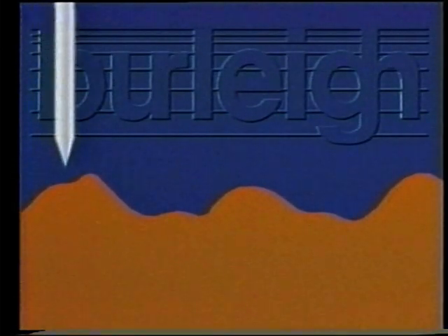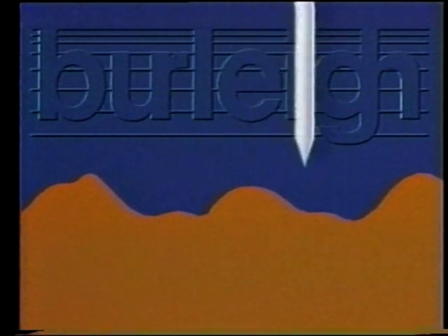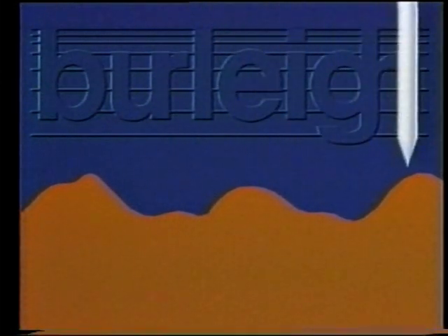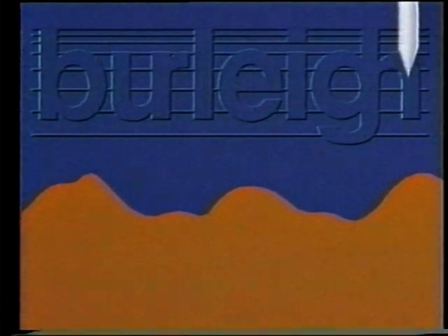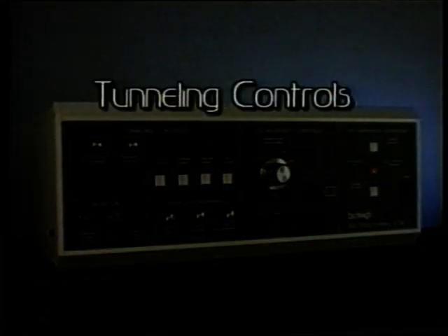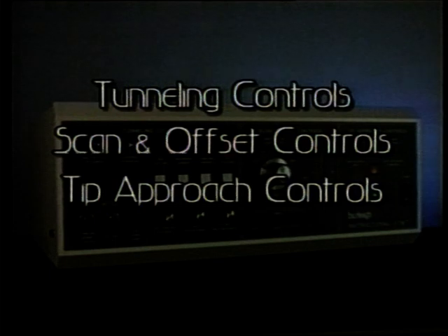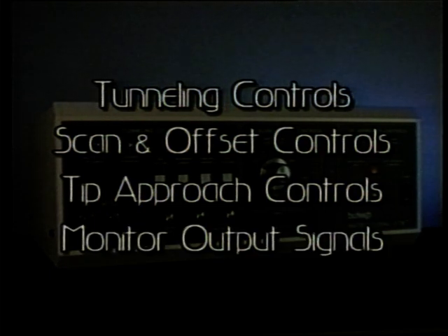In addition to the constant current mode, the Instructional STM will operate in a constant height mode for selected imaging applications. The Burleigh Instructional STM controller is easy to operate with its functions divided into 4 sections: tunneling controls, scan and offset controls, tip approach controls, and monitor output signals.